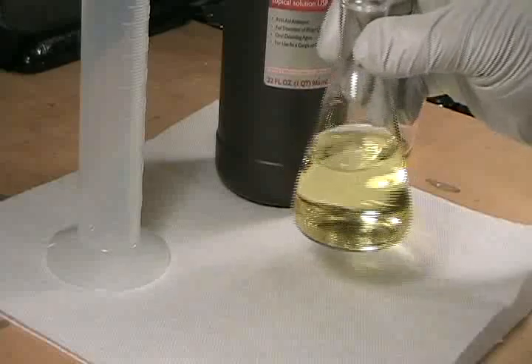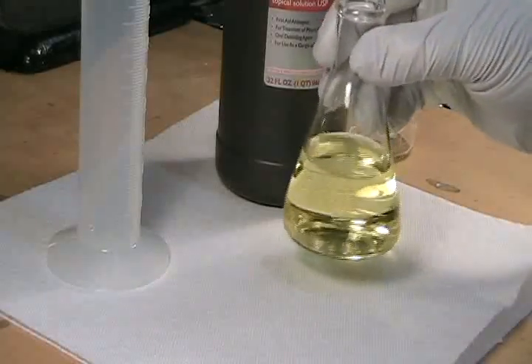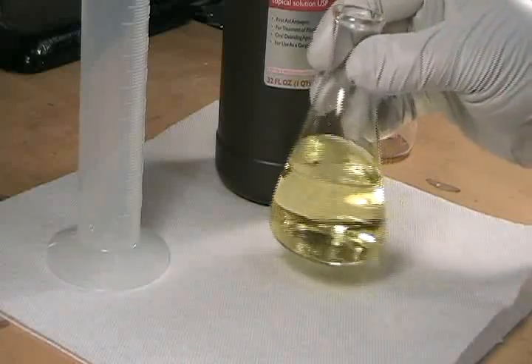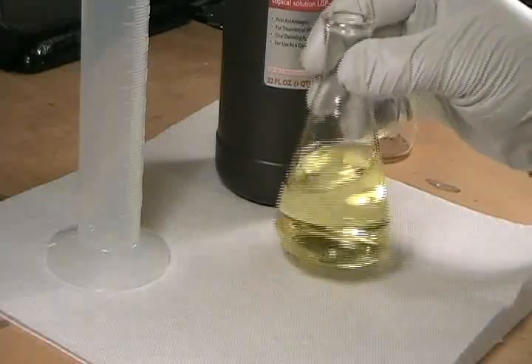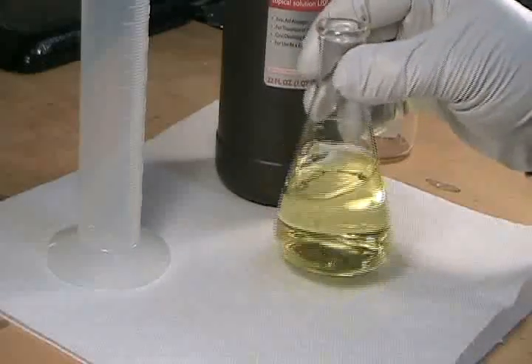For the first few seconds, nothing appears to happen. As the reaction proceeds, the solution assumes a gradually deeper yellow color as the bromide ions are oxidized to elemental bromine. We'll allow this to sit for the reaction to continue to completion.